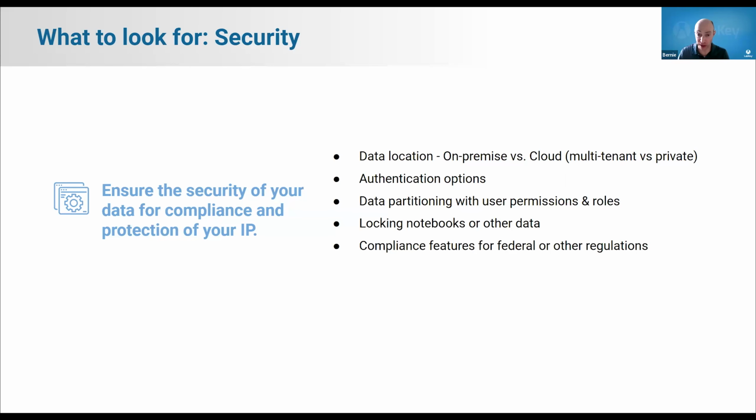Then there's the front door to these systems. There are many methods for authentication. The way you sign in and are identified in the system. Many requirements may exist in this space, including things like the need to support two-factor authentication and single sign-on technologies, as well as many others.